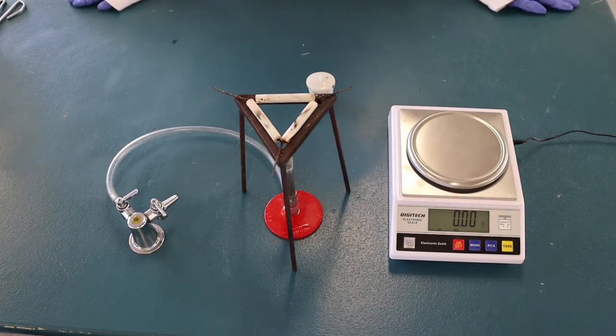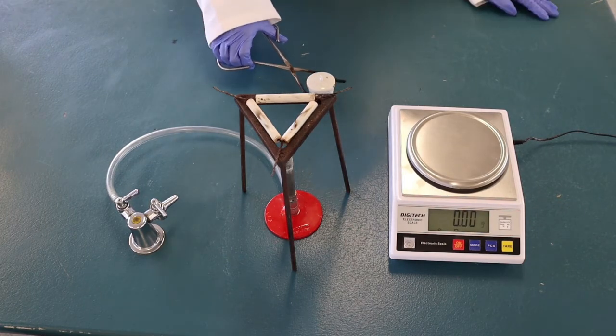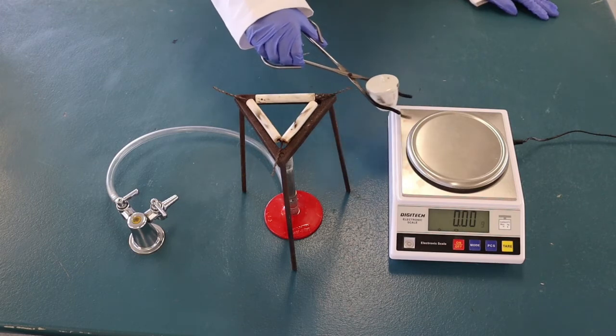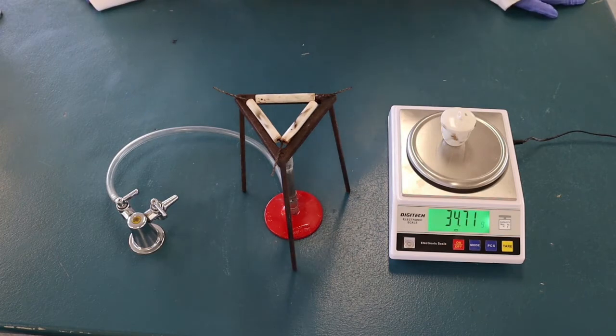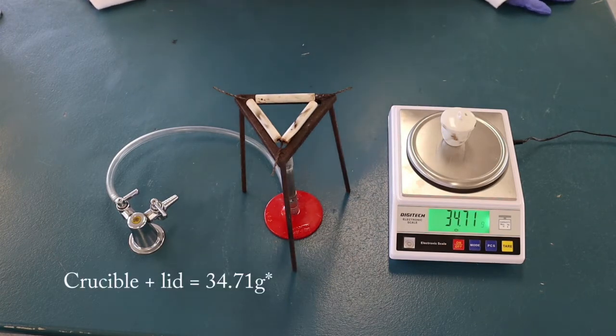Weigh the crucible and its lid on the scale. The crucible and the lid weigh 34.72 grams.